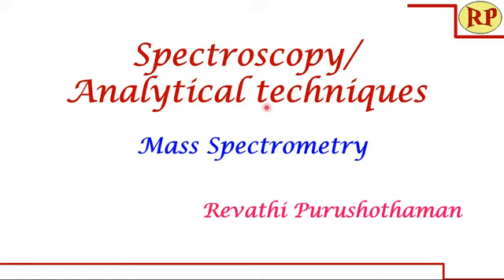Welcome to another session of spectroscopy or analytical techniques. Today we'll understand about mass spectrometry.